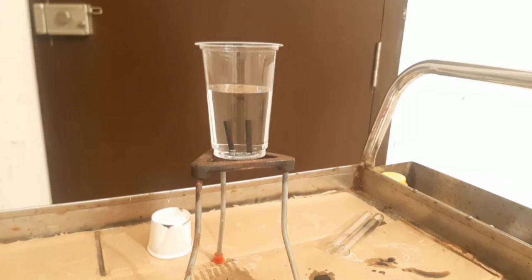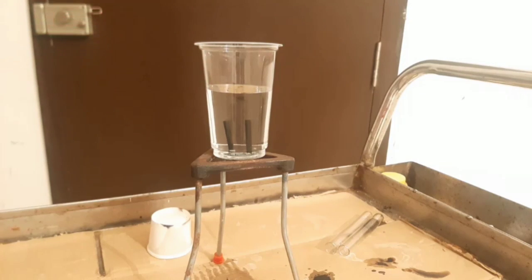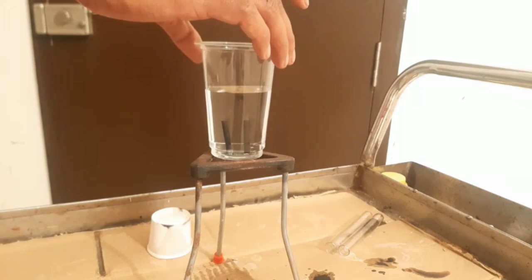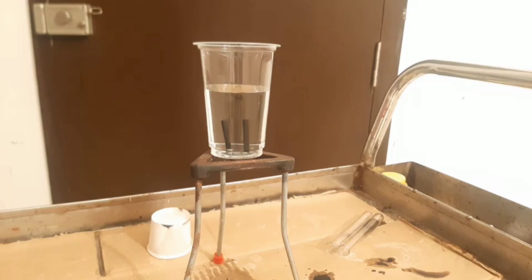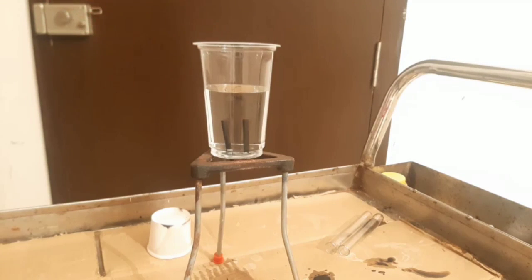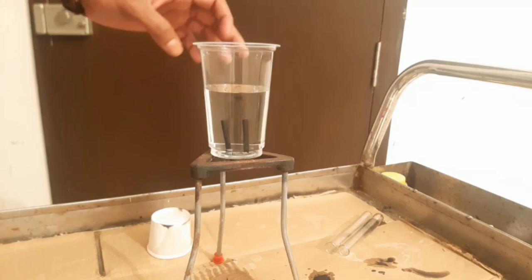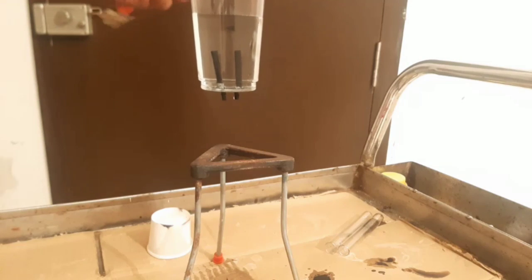This is activity 1.7. The apparatus required is something called an electrolytic cell. It consists of a glass container in which I have taken water that is made acidified — that means a few drops of acid have been added into it — because I want to pass current through it, and pure water does not conduct electricity. So that's the acidified water.